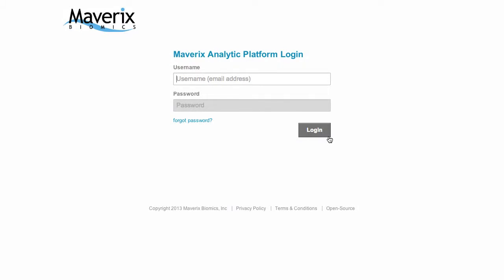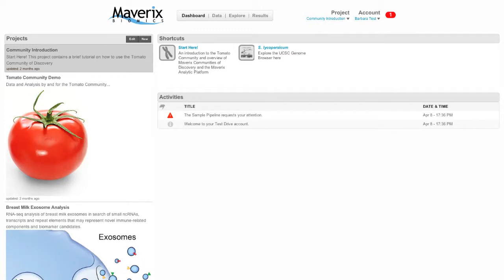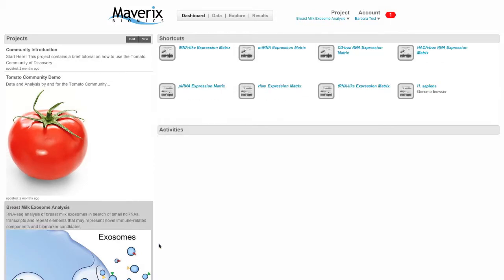Starting from the login page, enter your username and password, then click login. This will take you to the main landing page on the platform, which is called the dashboard. On the left side of the dashboard is a list of all the projects associated with your account. You can switch between projects by clicking on the image or description.